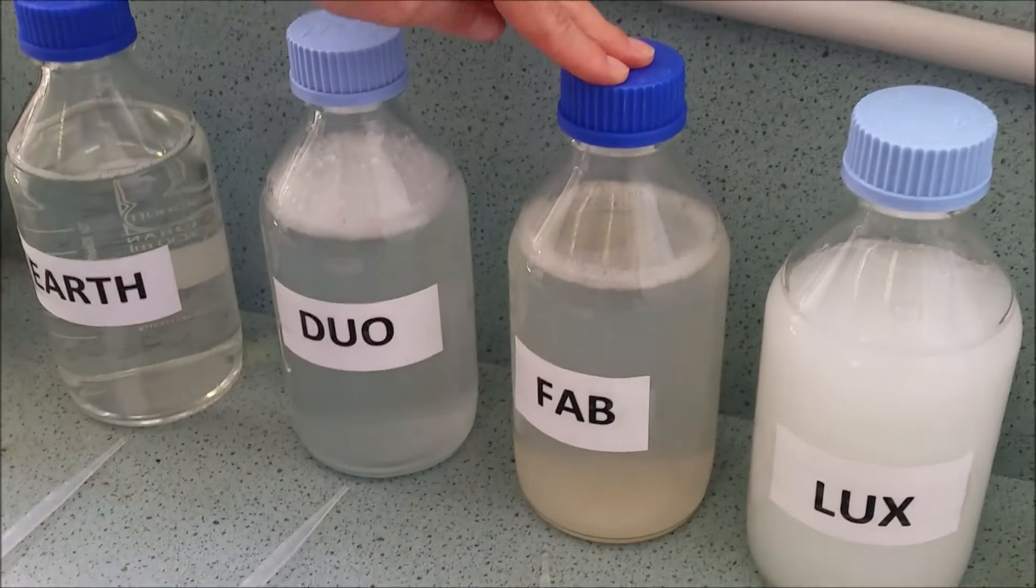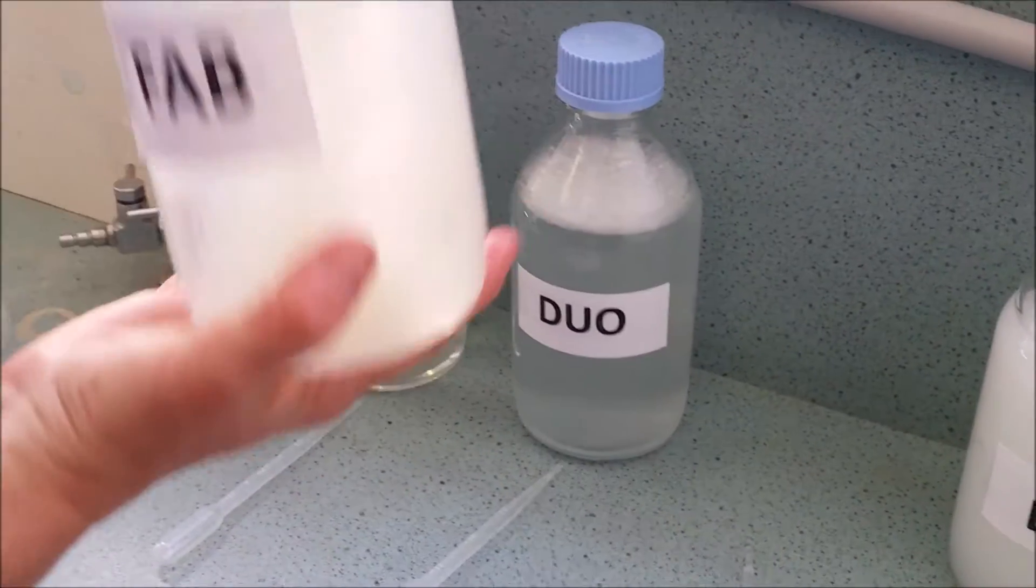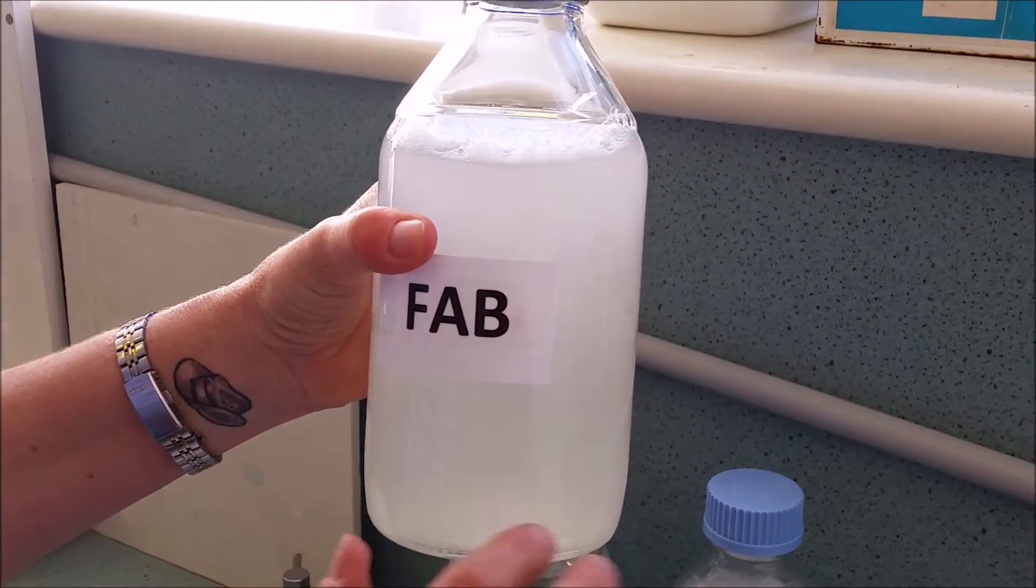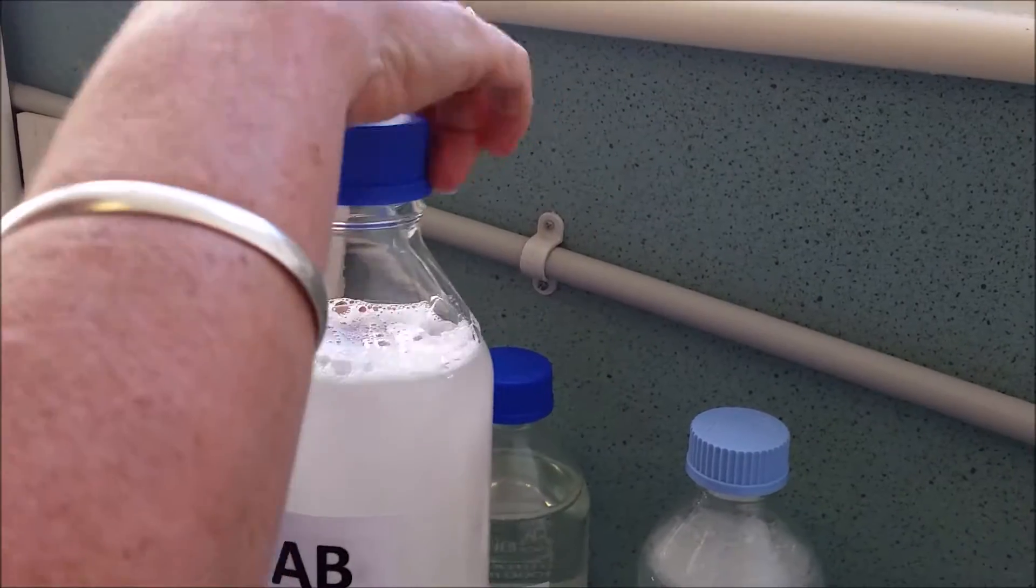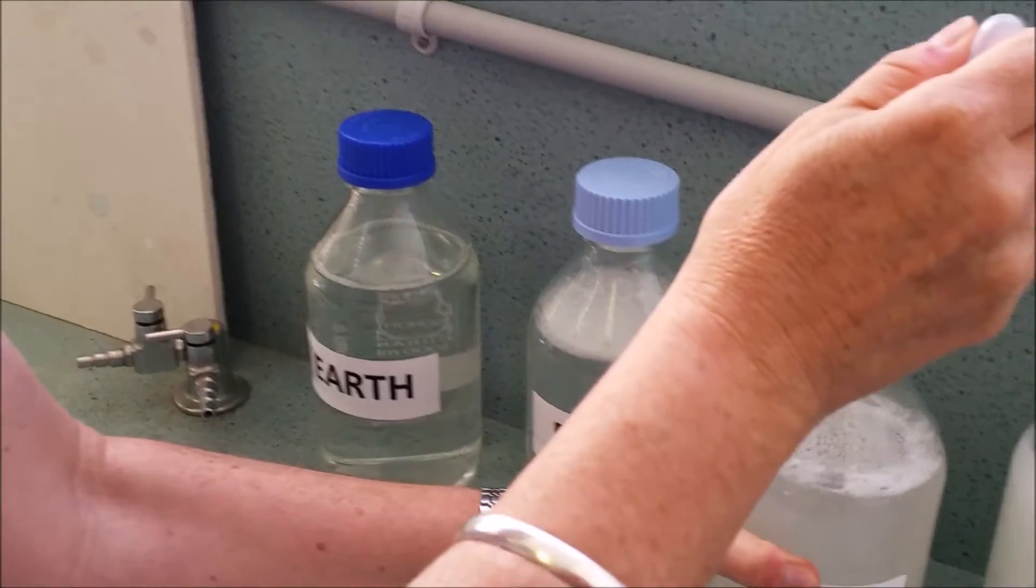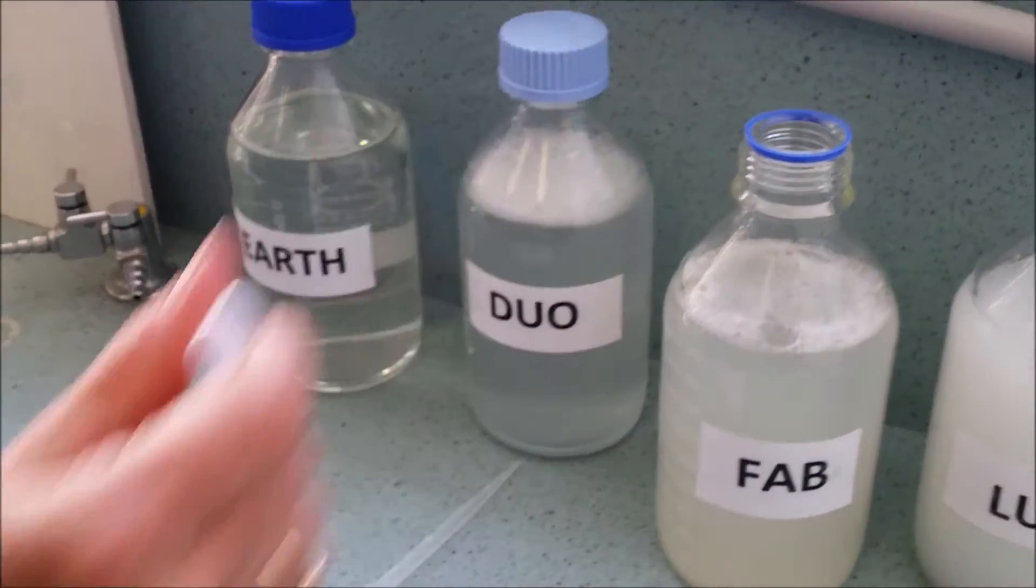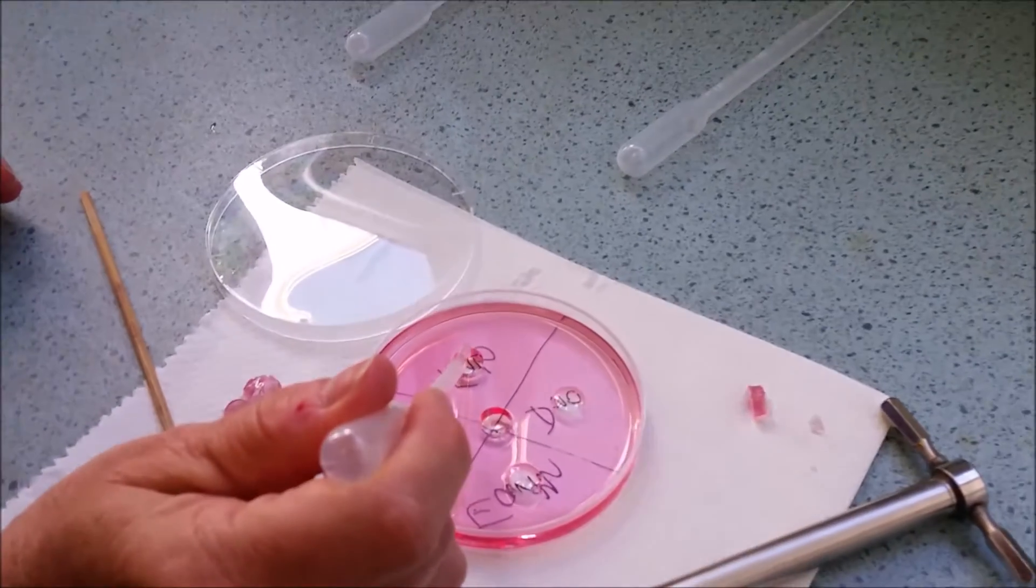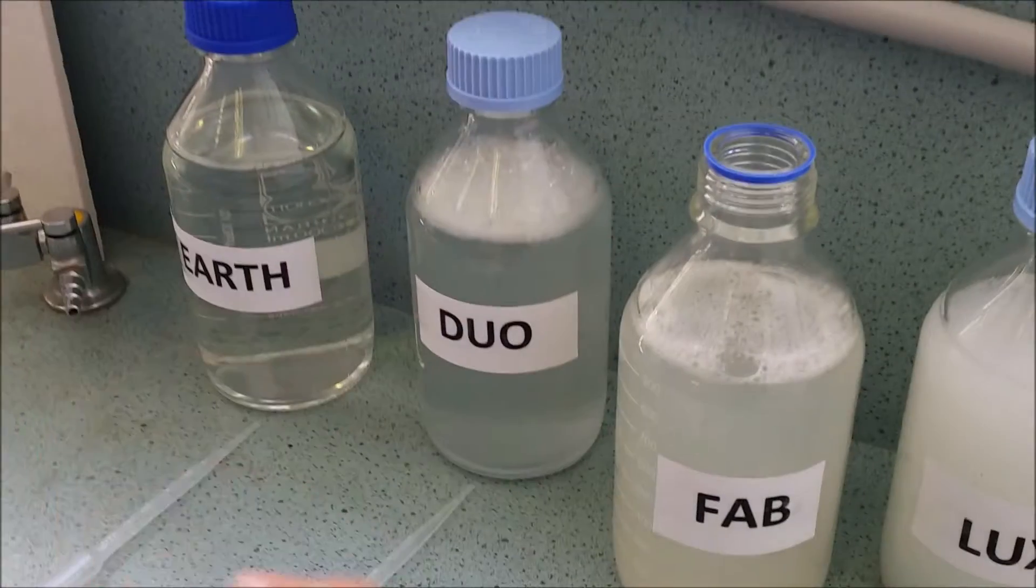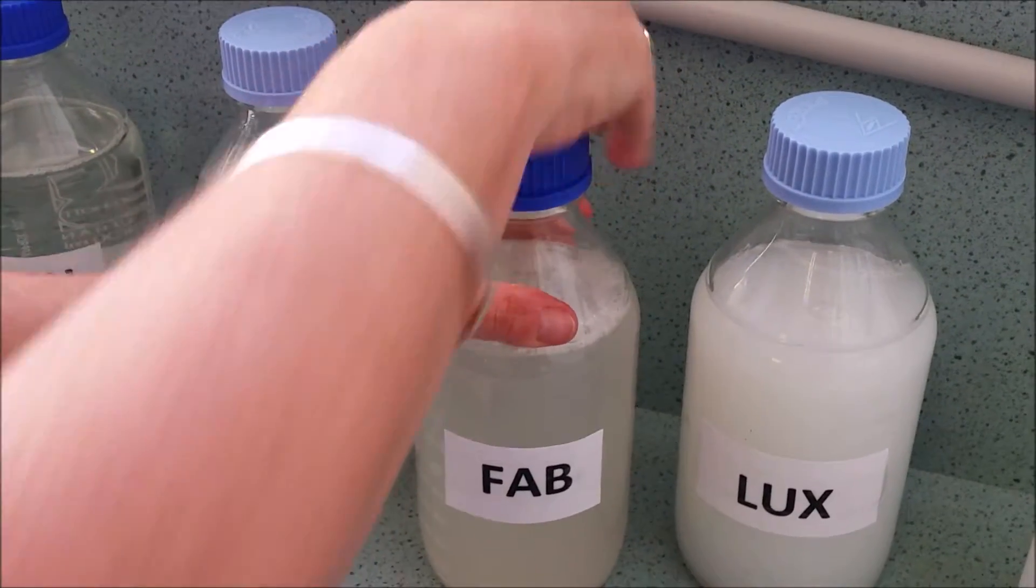Fab is up in this top corner here. Check the lid. Tipping upside down. You can see how the precipitate had settled. It's important to ensure that we get some of that. Counting. One, two, three, four, five. The lid's gone back on.